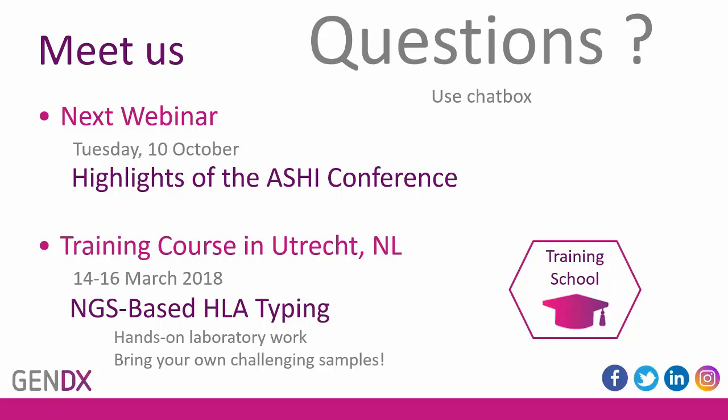Another question, what about the Ion Torrent sequencers? In this webinar I only spoke about Illumina, but if you compare the Ion Torrent workflow with the Illumina, then the Ion Torrent workflow is already quite simple. There is no indexing PCR, and the pooling already occurs directly after the ligation because we use barcoded adapters. So there's no need to make a choice. You already do this single tube cleanup step. So in that sense, the workflow for the Ion Torrent is already quite simplified, and now even more comparable to the Illumina workflow, because you do the library pooling just after the adapter ligation. Exactly, and before the first size selection and cleanup step.